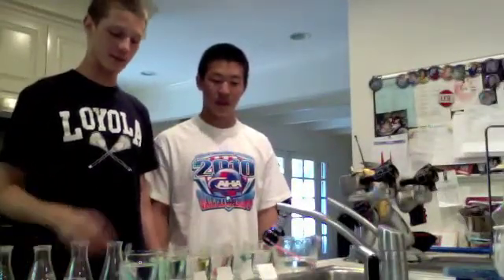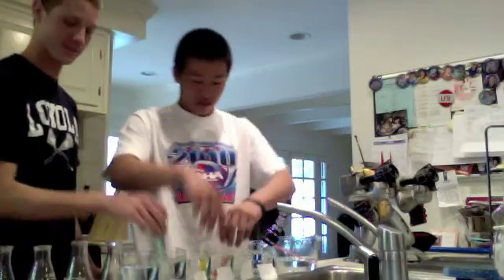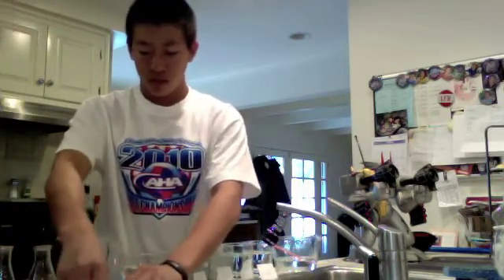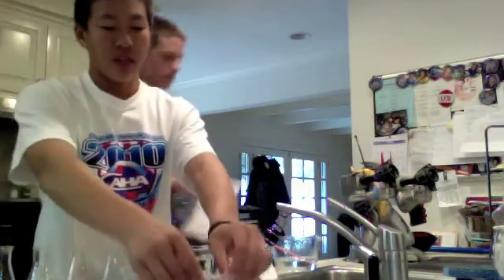After the time has elapsed, we will remove the dialysis bags and dry them off before we can properly weigh them. After they have been dried off, we will put them on the scale and measure their weight in grams and record it.